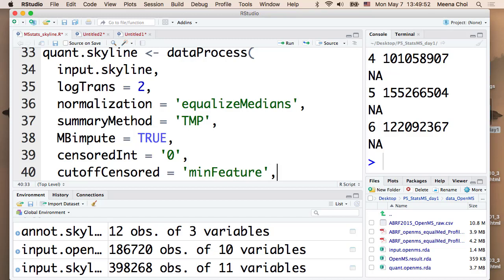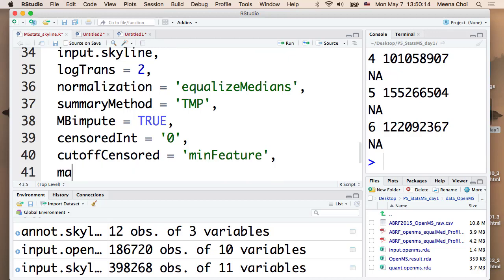Okay, then, from where, like what kind of guideline value do we have to use for the feature? That is this option. So let's just make a guideline. When you impute, just use the minimum value of each feature. That will be your guideline, and then just use another model for that. That is the option.